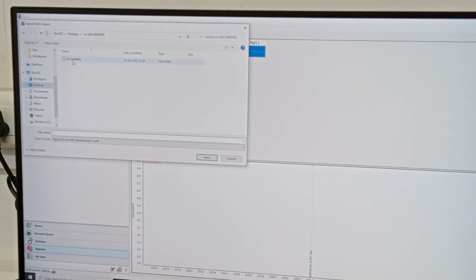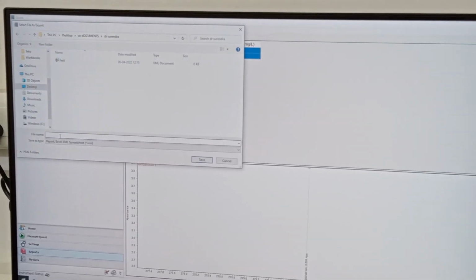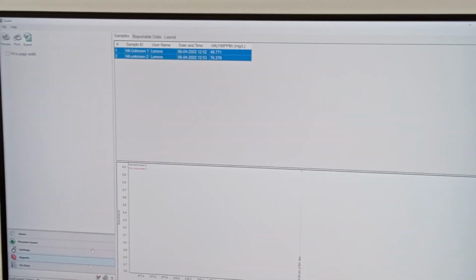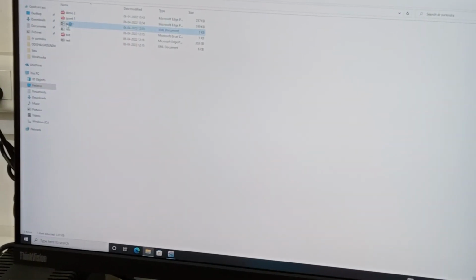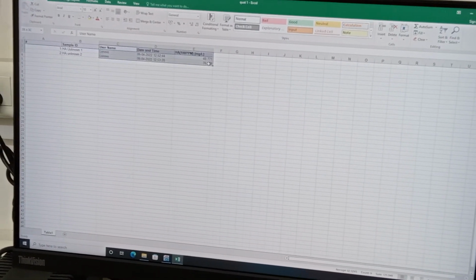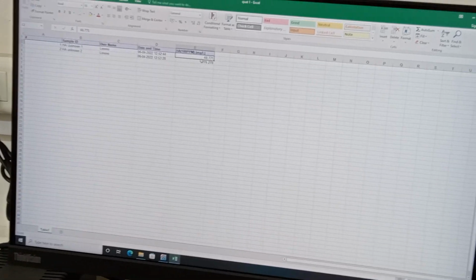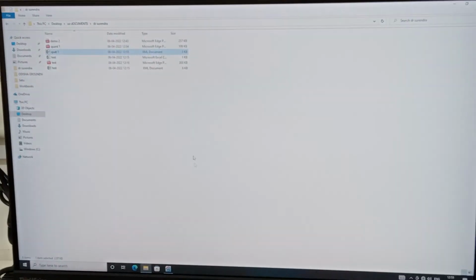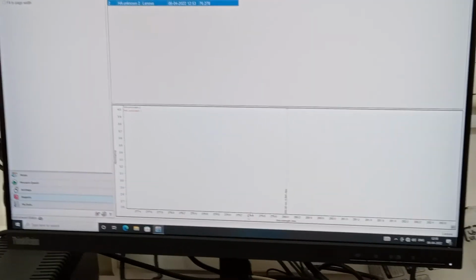Right, UV documents, Dr. Surendra, quant 1, fine. Now quant, you can see this Excel file. This is how the data will be given in the Excel file. You can see 48 concentration, 76 concentration is there.